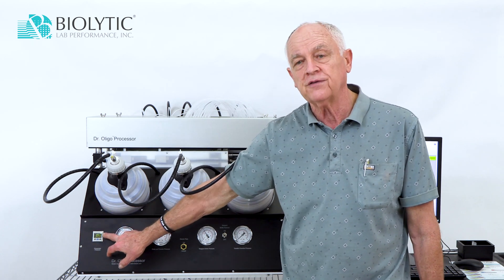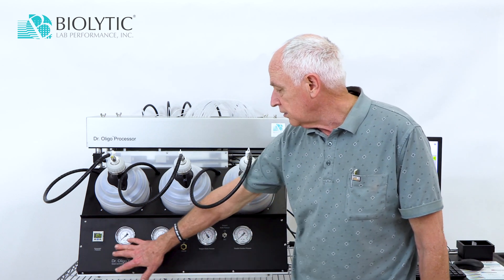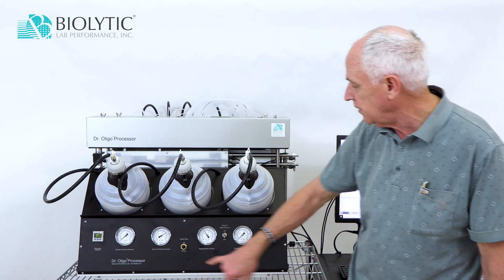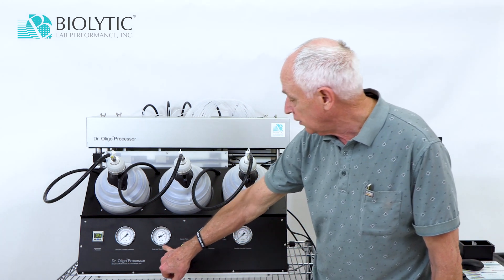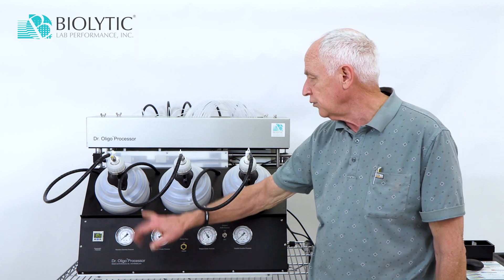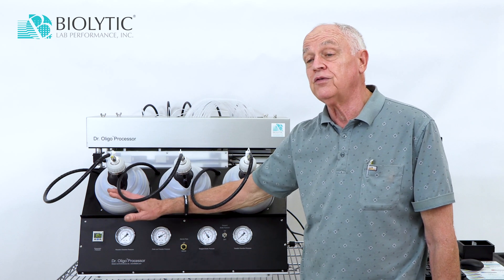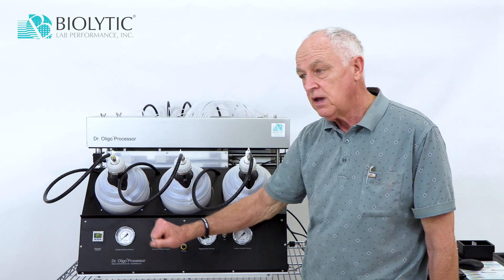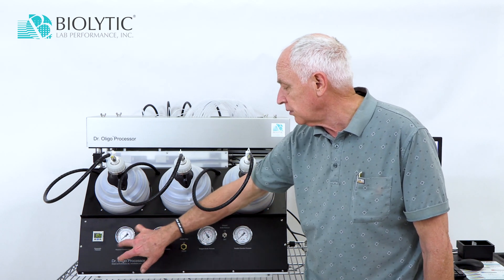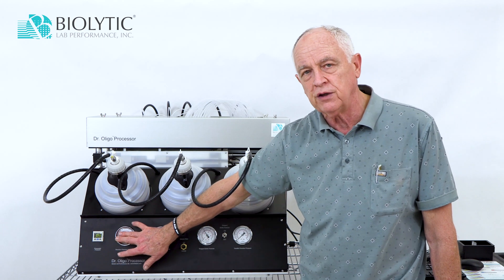We require 100 PSI to operate the instrument. Going across the front, we have a few analog gauges. There is a gauge here that is the drain pressure, and this is the pressure we're applying to the tops of the columns to move reagent through them. That pressure will show up here on this gauge — this is the pressure that's actually being used at any given point in time.